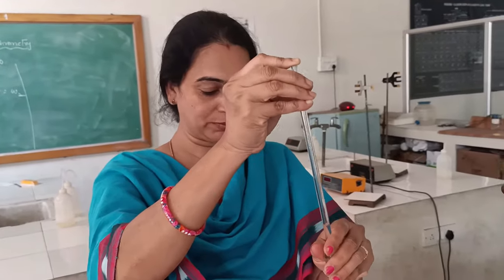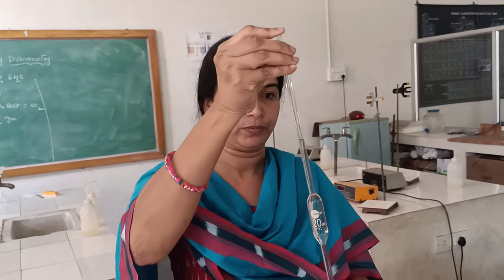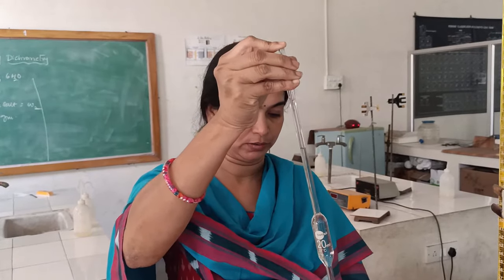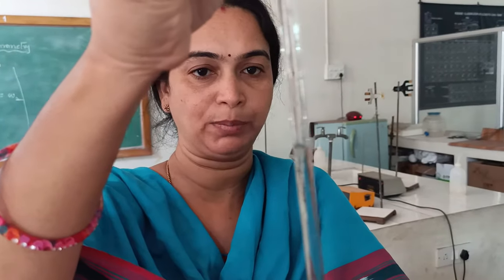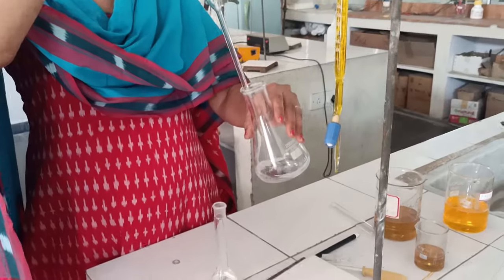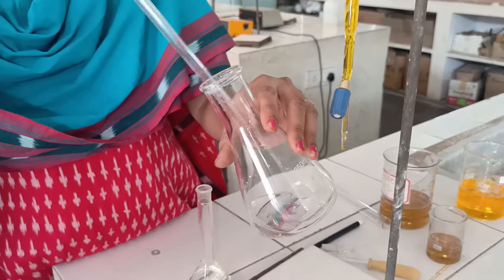Hold the pipette with your forefinger, not your thumb. When you take an extra amount of solution above the mark, relieve the pressure gently so that it comes down to exactly 20 ml of ferrous ammonium salt solution. Then release your forefinger and the whole solution flows into the conical flask. After you feel everything has gone in, give a small tap so that the entire solution falls into the flask.